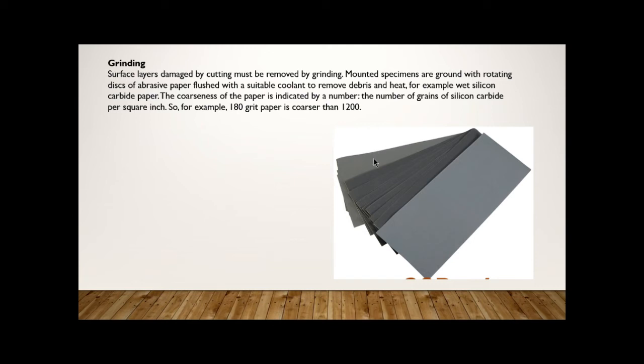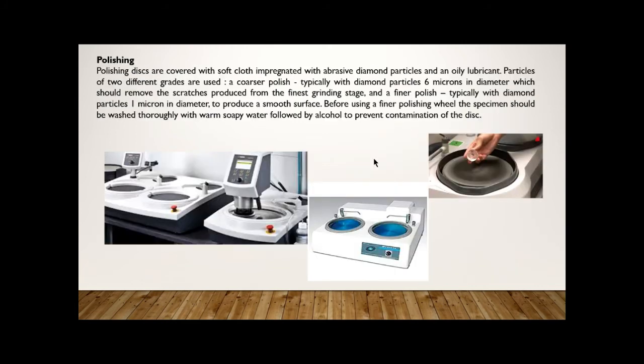After the grinding process, we should go for polishing. This is called a disc polishing machine. Most of the metallography laboratories are using this one. This is an automatic one. Here two discs are available. Depending upon the process, you can vary the speed. If you want, you can use water.